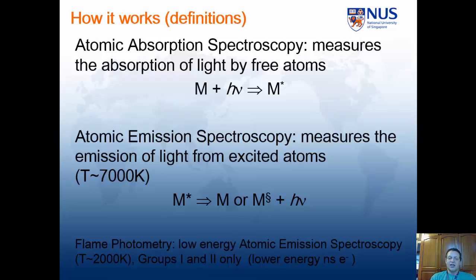the excited electrons, the promoted electrons, drop back down, sometimes to the ground state, but more often to a state, maybe a vibrationally excited level in the ground state. As the electrons fall from the excited state to the ground state, they emit radiation with a characteristic frequency.